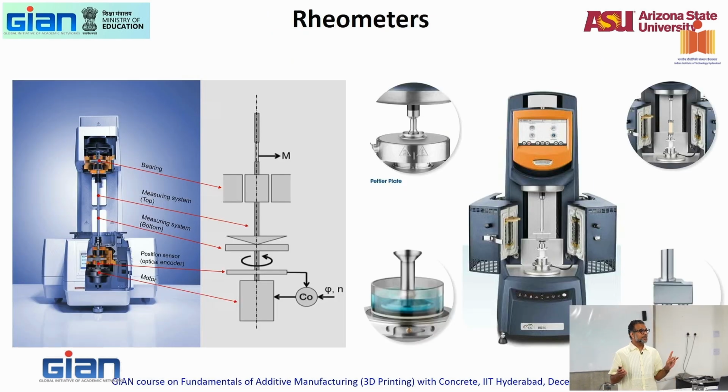Rheometers. Yes, there was a question. How can we incorporate solids? Like how can we test solids? Depends on the torque. If you have somebody manufacture a rheometer with an extremely high torque, you can test solids. So solid is more like elastic. The problem is then the atomic deformations will start to manifest. Now there are equipments that you can do elastic solid rheometry.